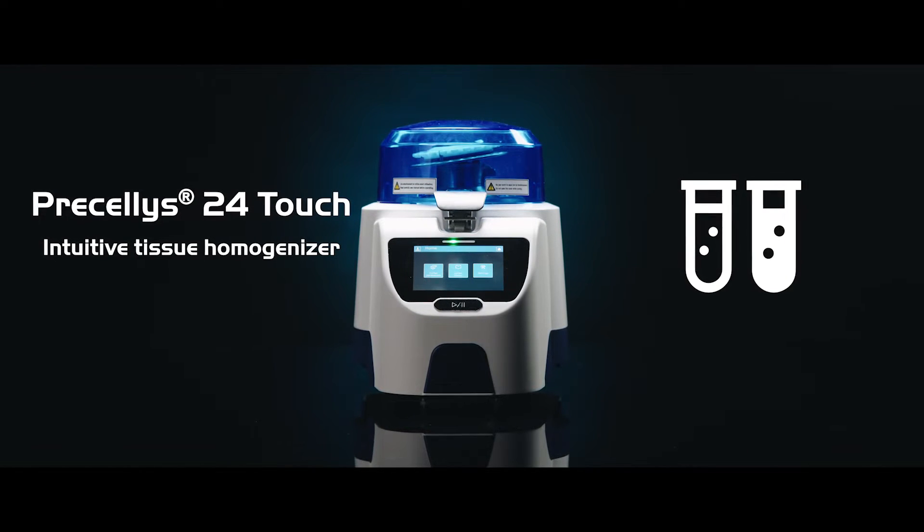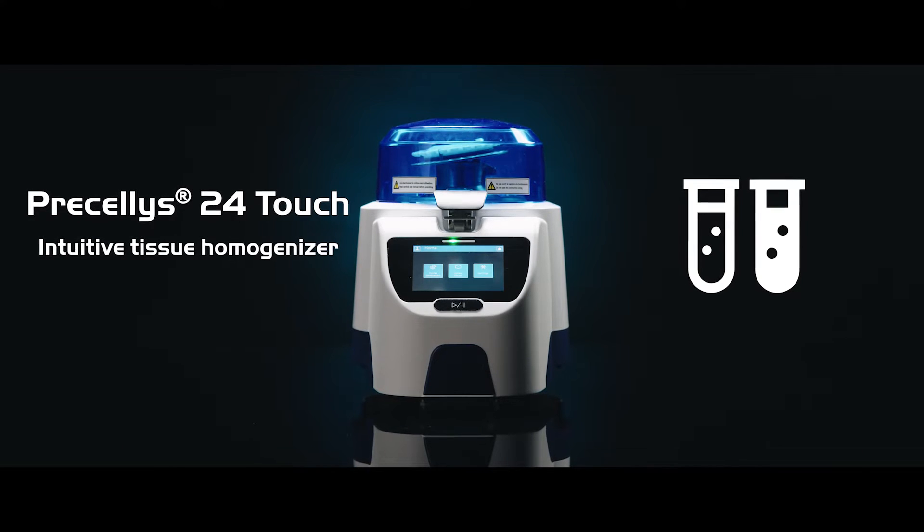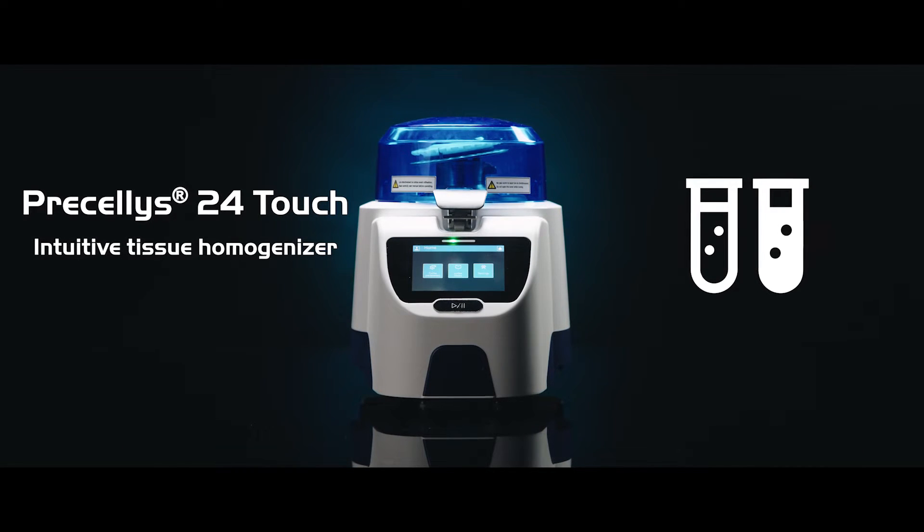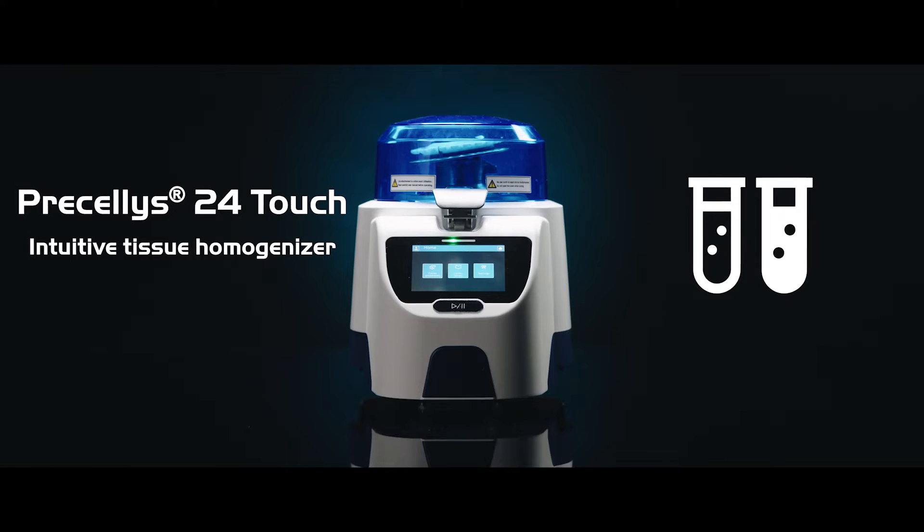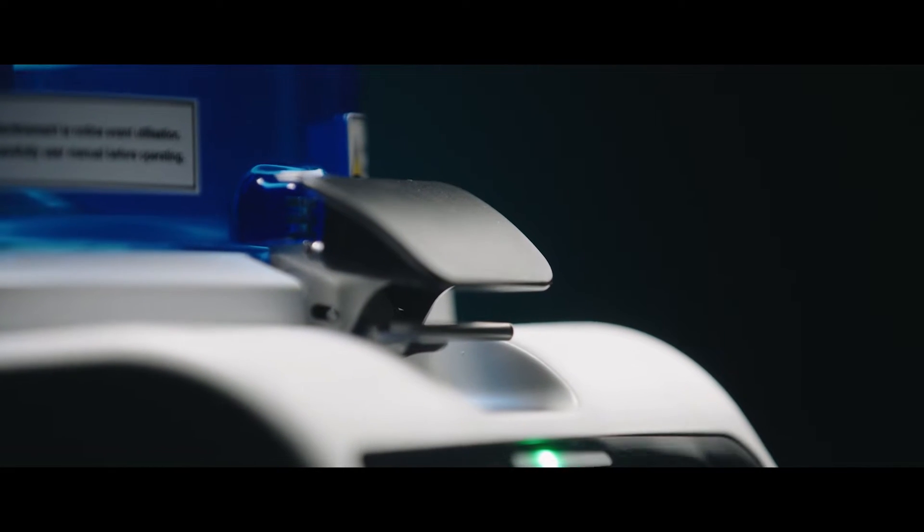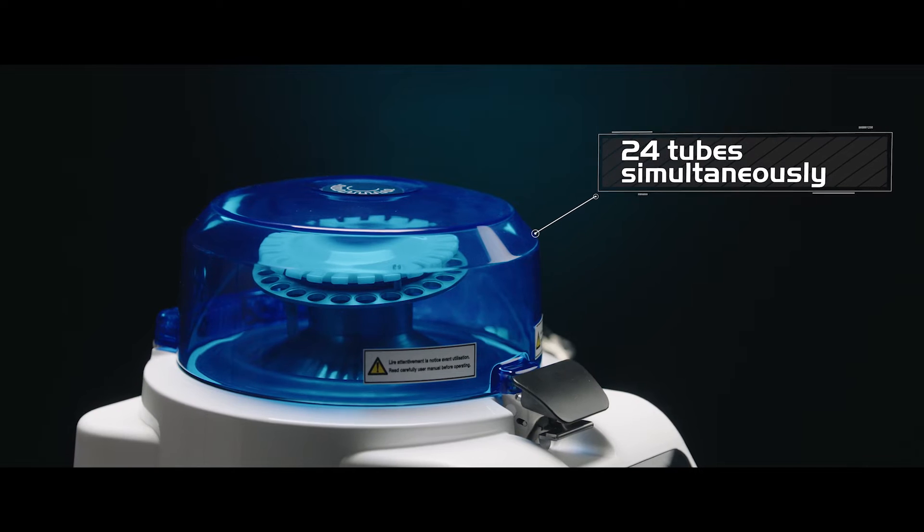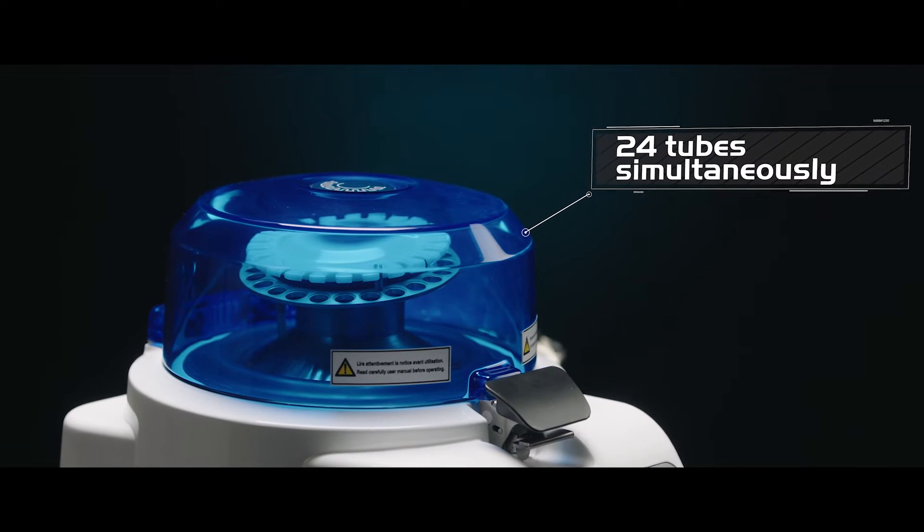Precelas 24 Touch is an intuitive tissue homogenizer for your sample preparation before analysis. Efficient Precelas 24 Touch has the capability to process up to 24 tubes simultaneously.